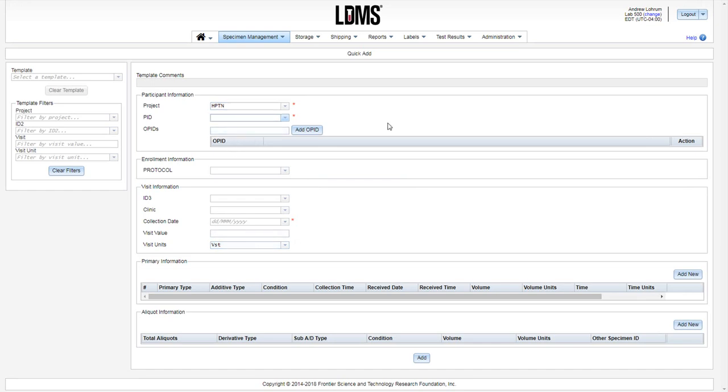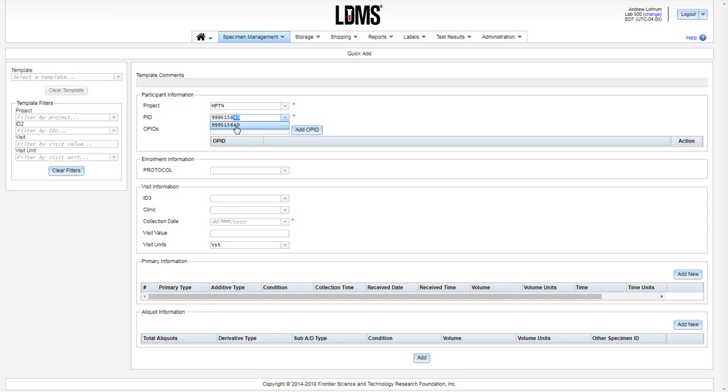Return to the Participant Information section and enter your PID. Note as I'm typing, it's filtering through the available participants in my LDMS. When you make your initial entry for a participant, it'll be a brand new PID. Every subsequent entry, it'll be available in this menu and you can select it.